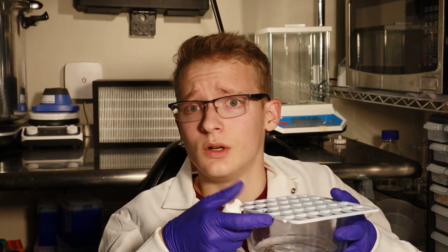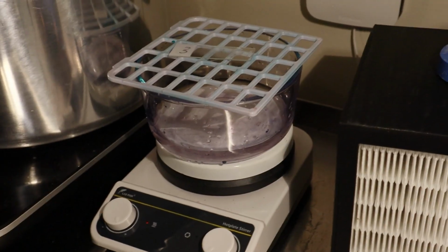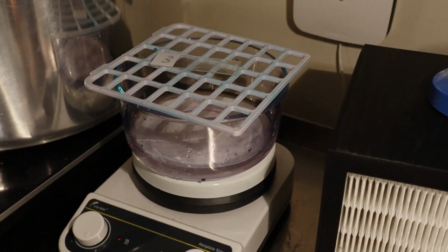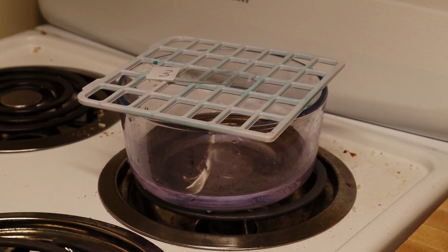The best method to enlarge the spores is to use heat to expand them while staining. To do this, I chose to use a steaming water bath. In my case, it's just a crystallizing dish with water, with a rack from my incubator above a hot plate. So I set up a crystallizing dish of water above my hot plate with the heat fixated slide and quickly ran into an issue. I was failing to get the stain to go above 50 C, so I desperately moved the dish to the stove.